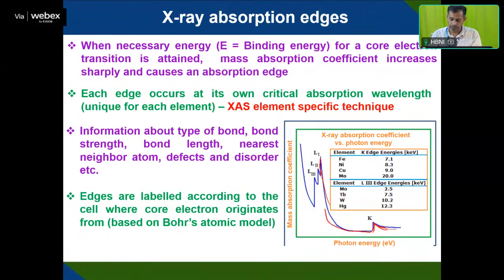Each absorption edge is characteristic of a particular absorption wavelength, which means this technique is specific to each individual element.